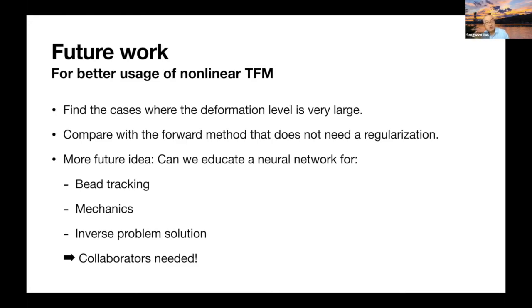So can we educate the neural network to do better tracking of the beads? And can we also educate the mechanics to the neural network to reconstruct the force directly from the bead images? Or can we get a better inverse problem solution using this neural network? That is the one thing that I want to share.